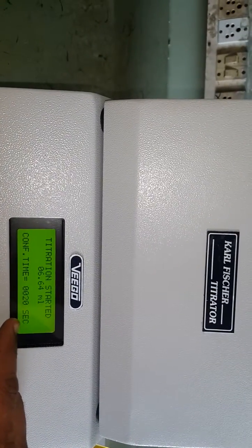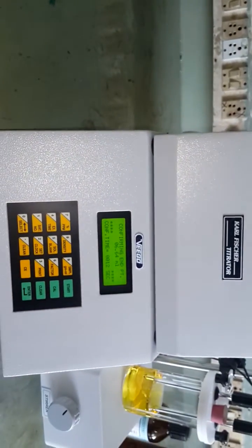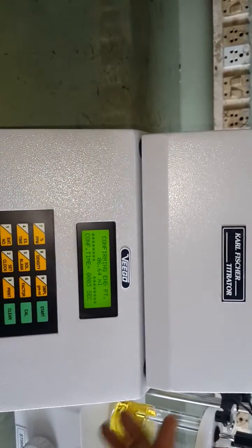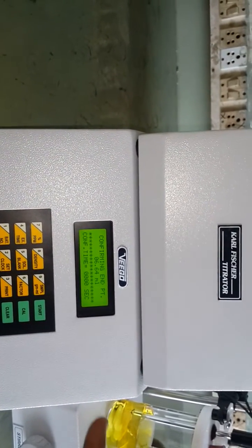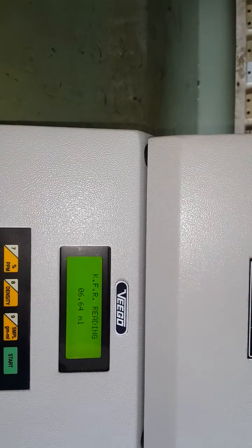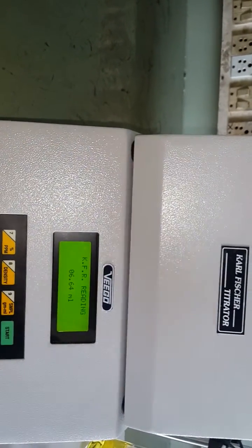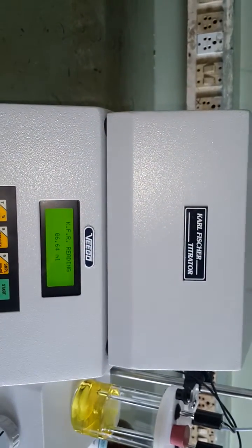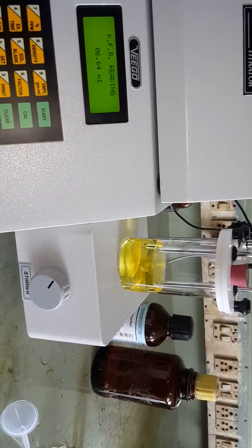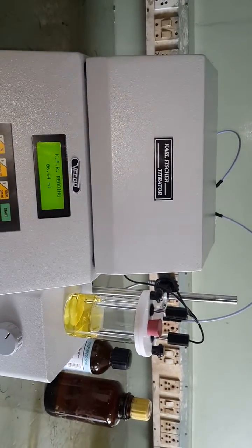The titration continues until no water is detected continuously for 20 seconds. When the excess water signal remains off for 20 seconds, the final endpoint is reached. If water is detected again, the reagent is added and the timer resets to 20 seconds. The result is 6.64 ml — this is the volume of Carl Fischer reagent required to neutralize the water content from the methanol, completing the first stage.